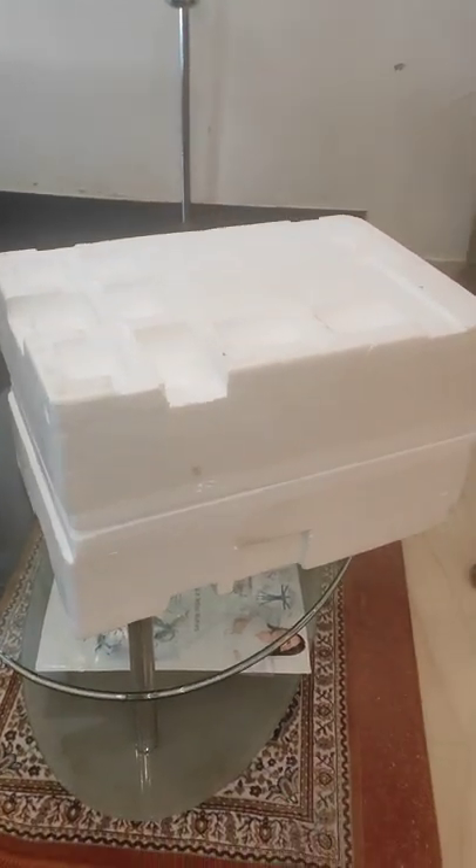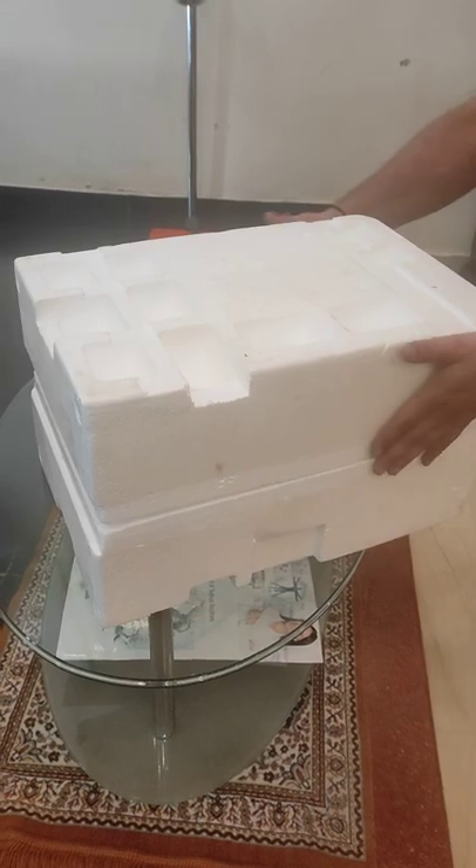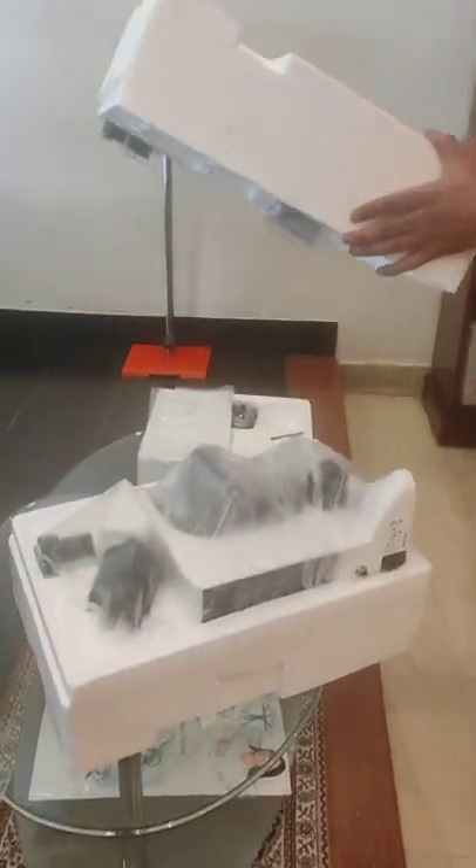Nicely. Now we will remove the upper styrofoam box. This is how the microscope is placed.